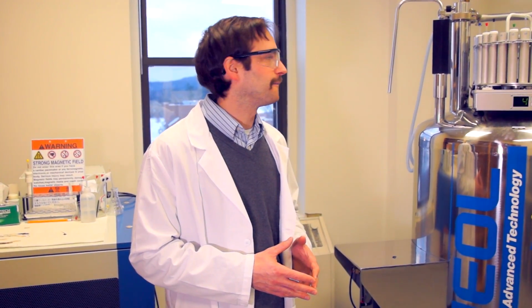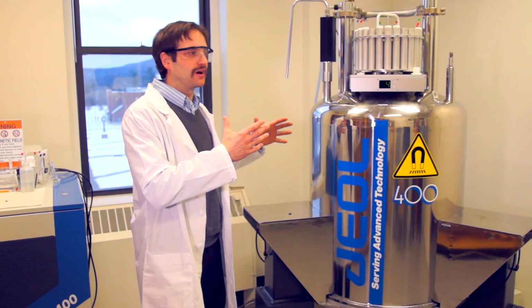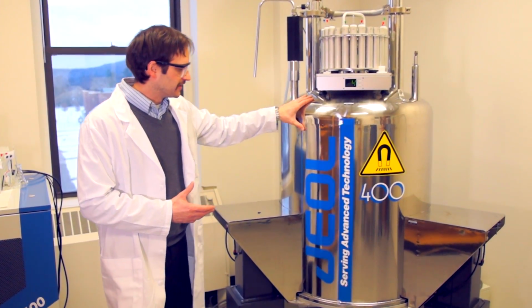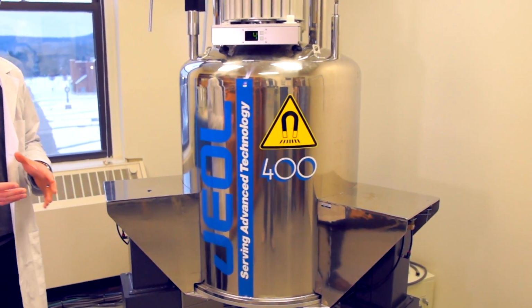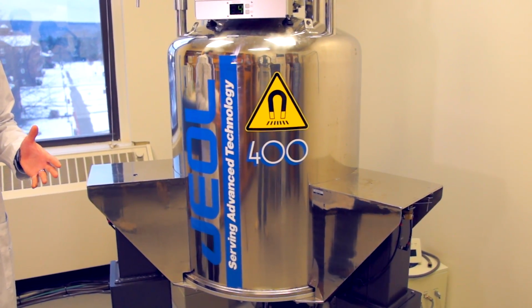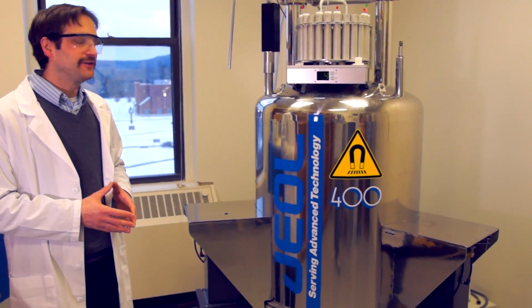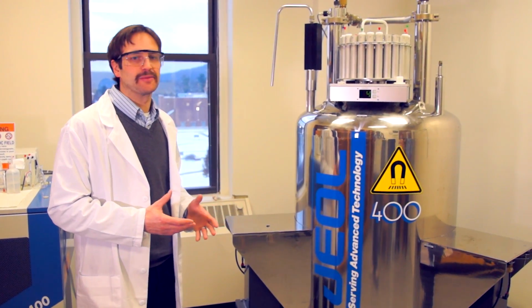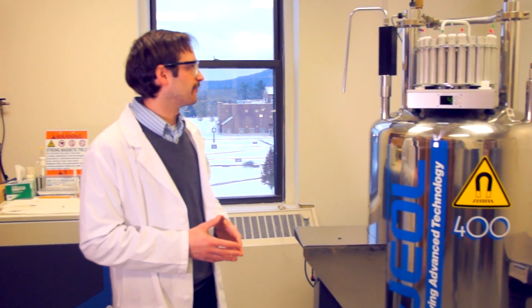So the main piece, and what most people can equate with NMR, is the magnet that we have here. This is a 400 megahertz NMR, and the 400 stands mainly for the magnetic field strength that's constant with this instrument. That magnetic field comes from a superconducting magnet that's inside, kept at about 4 degrees Kelvin by using liquid helium, very cold stuff.